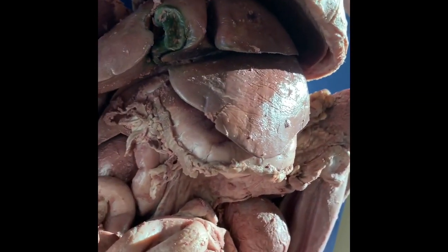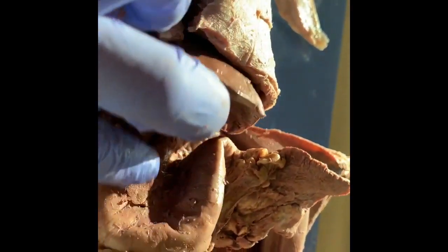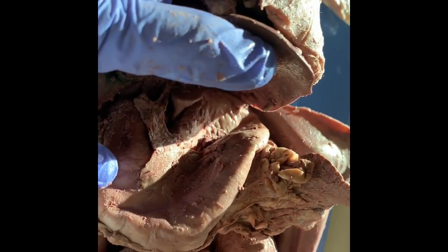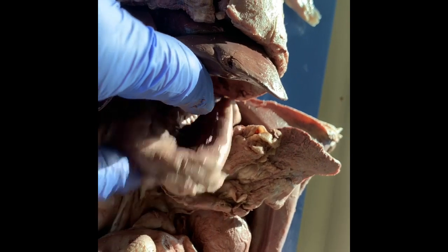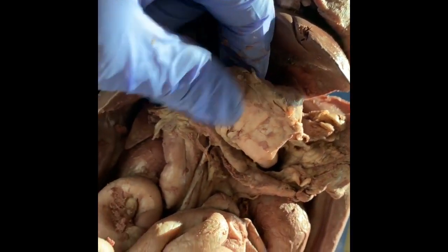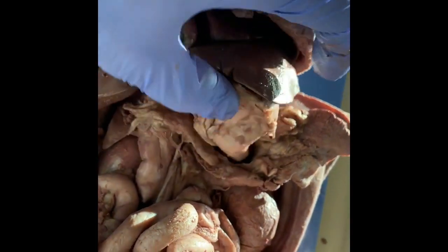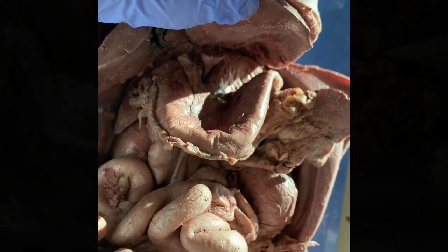Okay, so now you can see the intestines. The first thing we're going to do is pull out the stomach, and then I'm going to do a butterfly cut, and we're going to look at the contents of the stomach. And it's pretty flaccid, so there's not much in here. Oftentimes it's totally inflated and the cat had a big old meal as its last meal. But give me a second. I'm going to pull this out and remove it, and then we can check out what's inside.